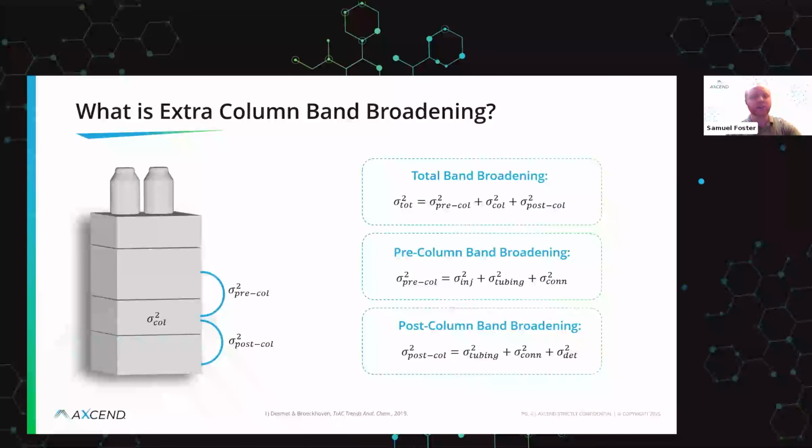And so taking a brief look at some of those different points of band broadening, we'll see band broadening from the moment of injection, so band broadening from your injector. You'll see band broadening due to connected tubing, and we'll go through a little bit of that, but also band broadening from your connections and unions. If you don't do those properly, you could run into issues of increased band broadening.